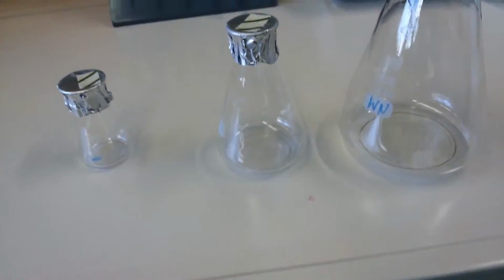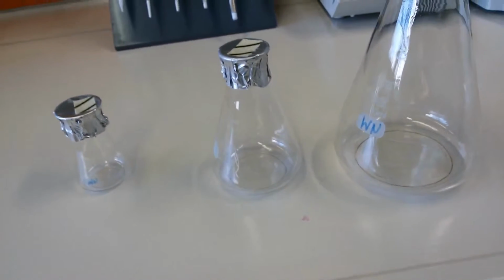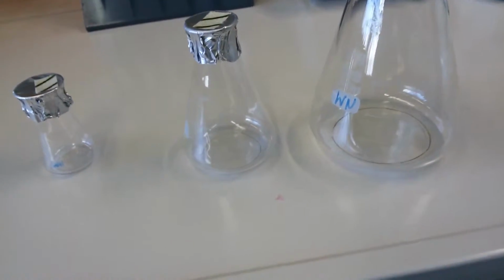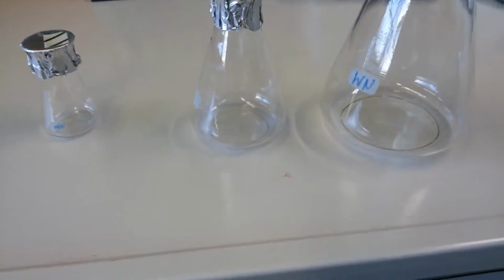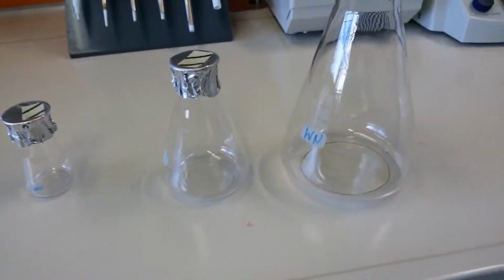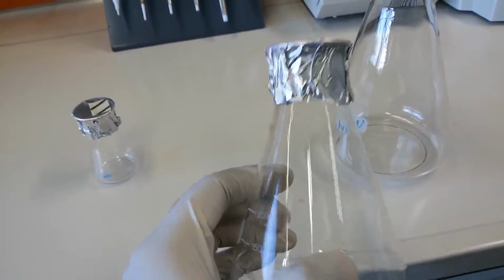So there should be some relation. If the volume is, let's say, 2 liter, you should not grow more than 50 ml of culture in the 2 liter, or more than 100 ml of culture in there. It depends on the different type of culture. We will talk about them in detail in our microbiological tutorial, but here I just want to introduce what conical flasks are and how they look.